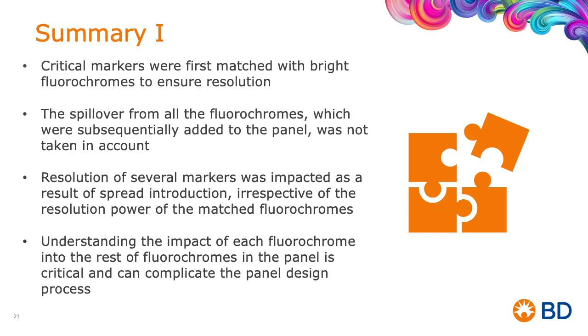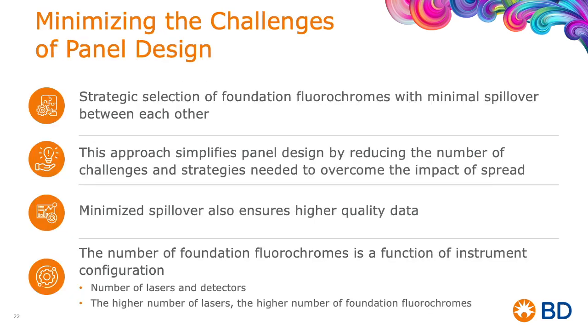And that's where panel design can become complicated and complex, because you need to be able to keep track of all the possible combinations. And that brings us to the last part of the webinar, the tools that we want to share with you and provide to you to really minimize this challenge of panel design, minimize the risk of making a wrong choice of fluorochrome that will have a significant impact on our biology.